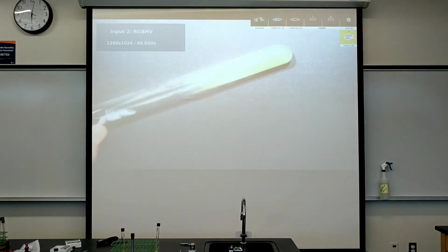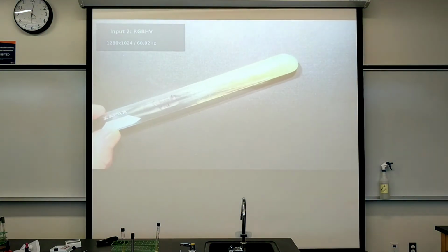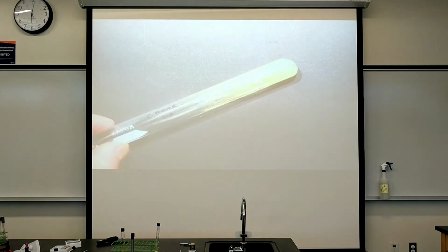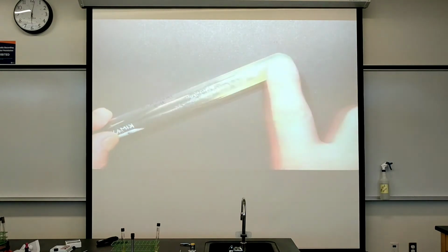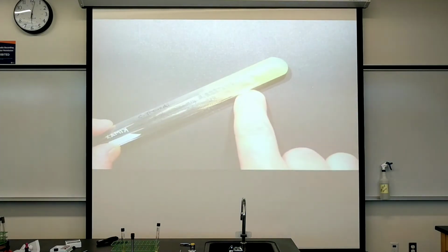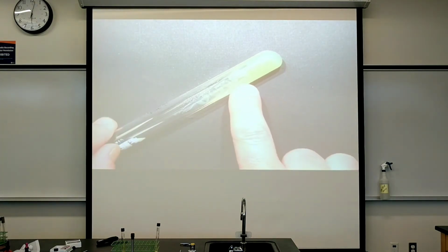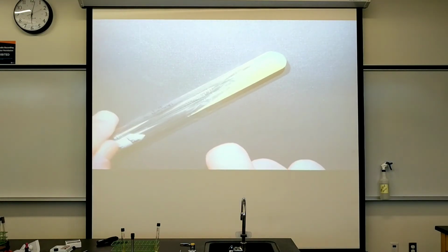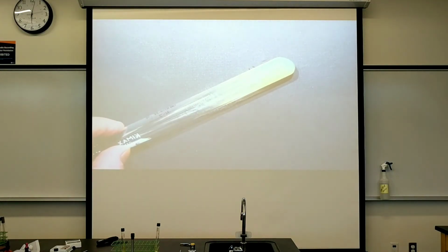This is the supply test tube that comes from our preparation beforehand. It's a little hard to see, but there's some moisture there, and you can see a zigzag of creamy bacterial growth all over the slant from bottom to top. We're going to be recreating that same pattern by grabbing just a small little bit of that.